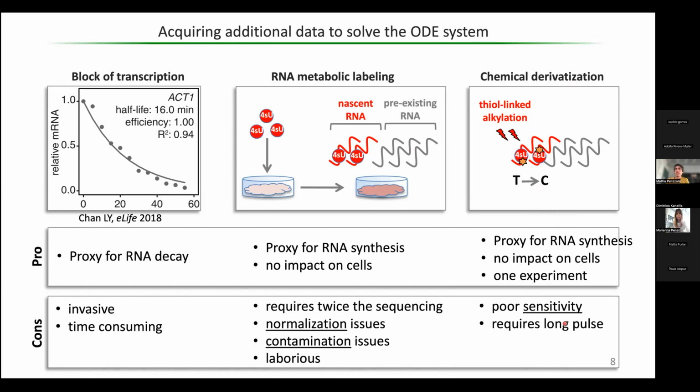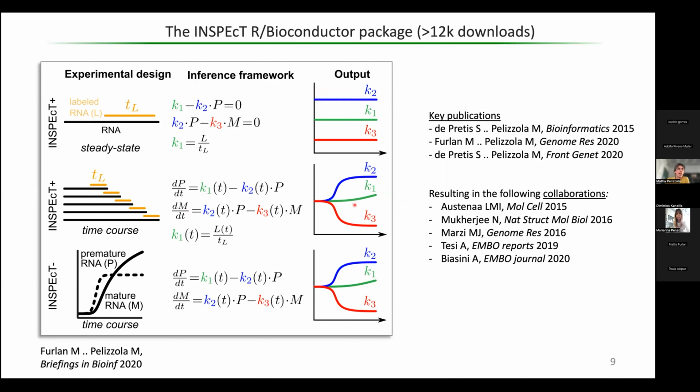So eventually, we developed a number of tools, under the umbrella of INSPEcT, a Bioconductor package, that offer the possibility to explore how synthesis, processing, and degradation are quantified and behave at steady state, or also how they vary across conditions or over time. And we even developed a solution in which metabolic labeling is not even required, but you do need to profile a time course experiment with several data points, at least 2 different time points.